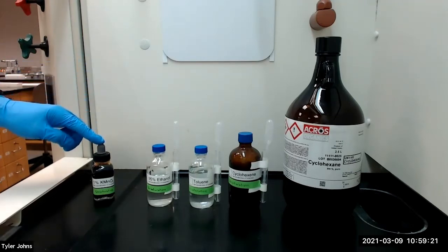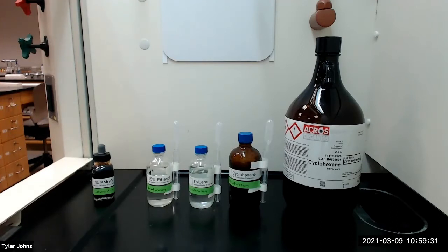We will then slowly add 1% aqueous potassium permanganate solution drop-wise. In a positive test for unsaturation, the purple color of the potassium permanganate reagent is discharged, and a brown precipitate of manganese dioxide forms.